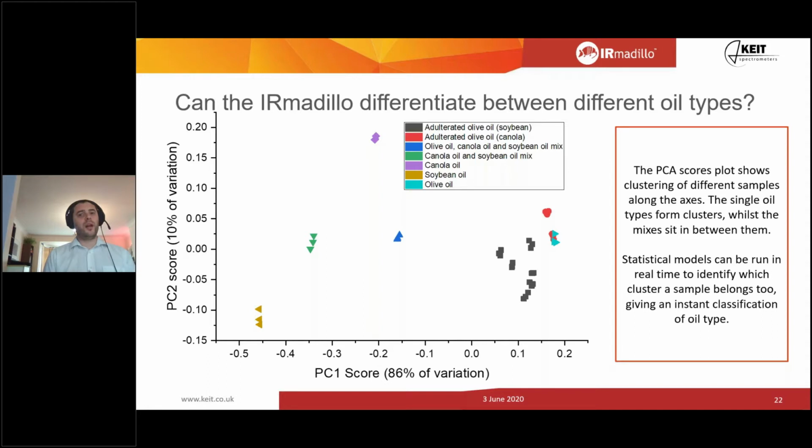So you can do that in real time and update every minute or 2 minutes on a continual pipeline if required. As I said, I appreciate for refining that may well not be terribly useful, but this is the kind of information that could happen towards the back end of a process to check you're within specification qualitatively as well as quantitatively. And I should point out that spectroscopy, all types of spectrometers, can run multiple calibrations at the same time. So you can have a calibration that looks for something qualitatively whilst also making a quantitative measurement at the same time with one instrument.